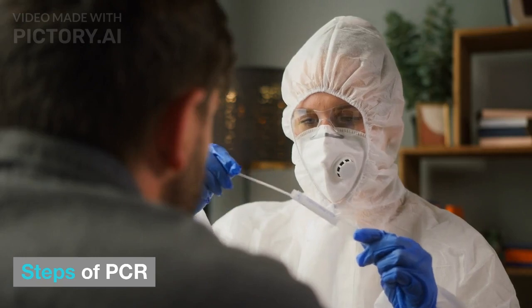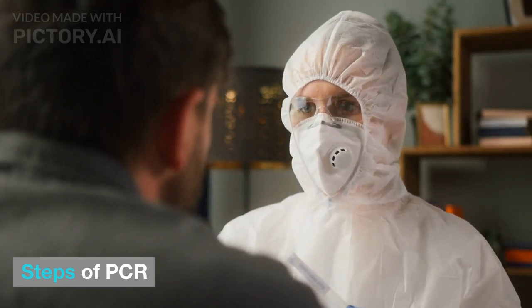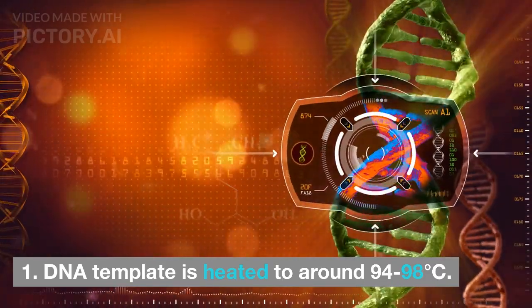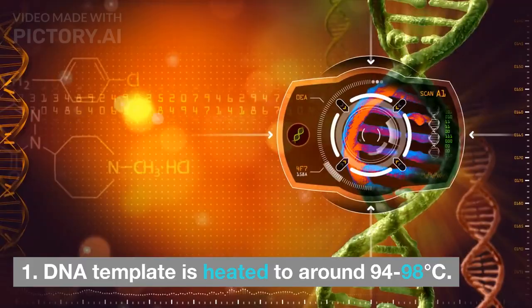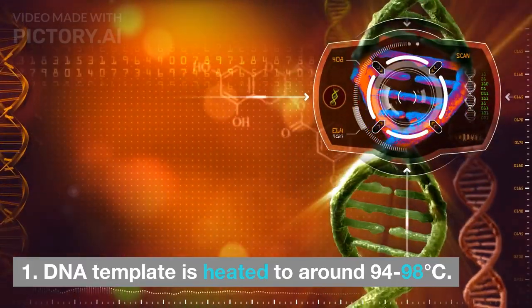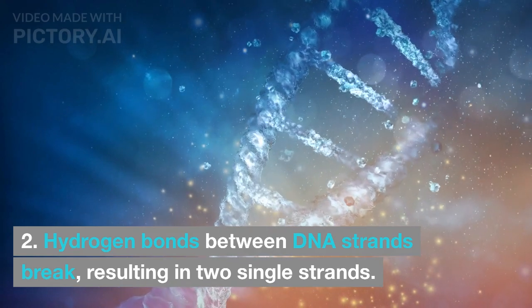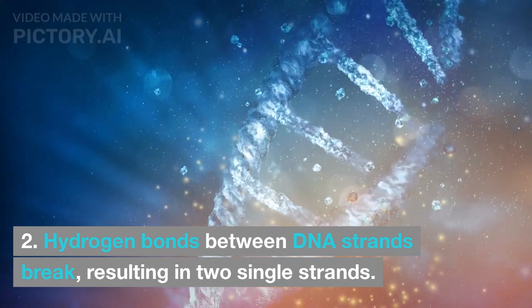Steps of PCR. Step 1. Denaturation. DNA template is heated to around 94–98 degrees Celsius. Hydrogen bonds between DNA strands break, resulting in 2 single strands.